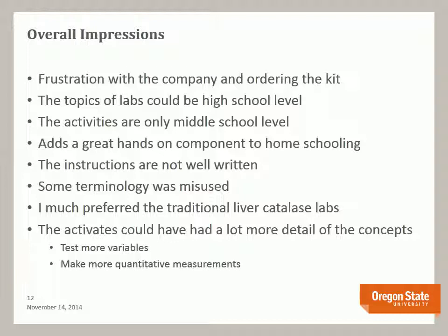I would say overall that I would recommend this type of kit, probably not from this company, but I would recommend a kit lab to people who are doing remote labs. I just think that they need to be beefed up a little bit and be more in depth so as to relate closer to what a traditional wet lab would be.